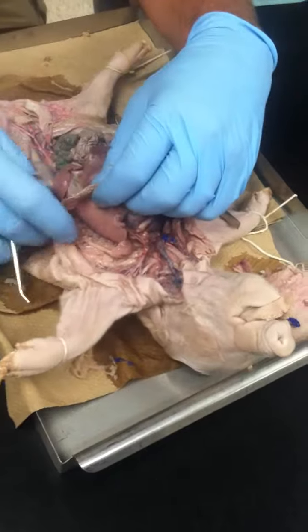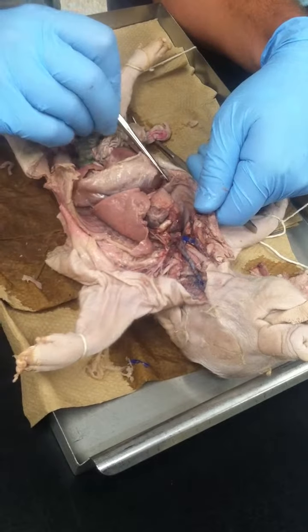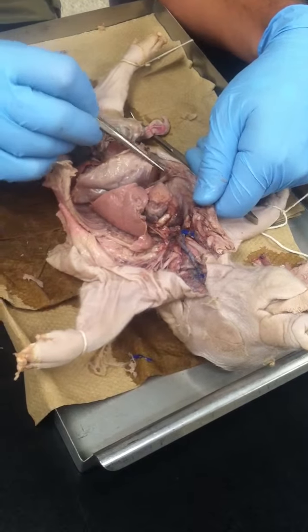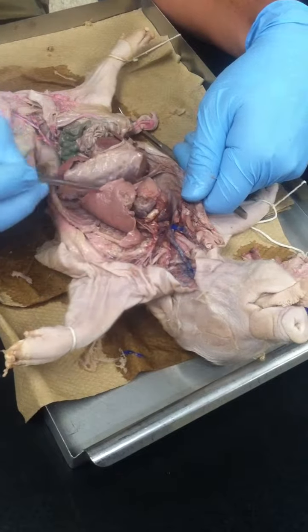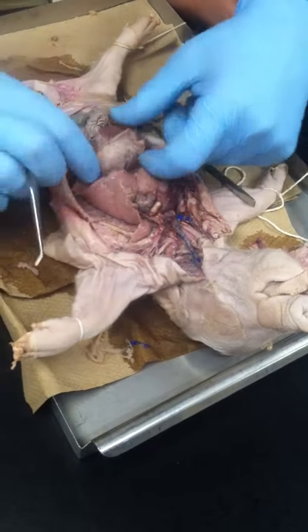This is your diaphragm. You can see it's still attached here. So your diaphragm, there's that separation between your thoracic and abdominal cavity, that diaphragm. You can see more of it there.